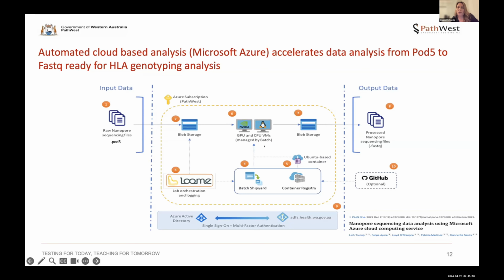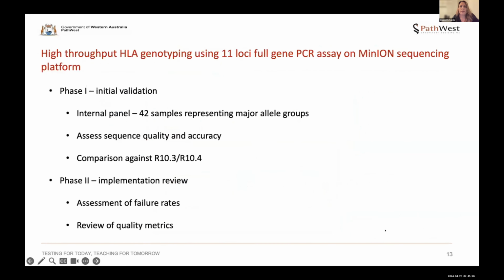Once that analysis is performed, it's sent to storage, but then also downloaded to network drives, where we then analyze the FASTQ files with NGS Engine. That has been published, so you can read more about that pipeline in that publication.